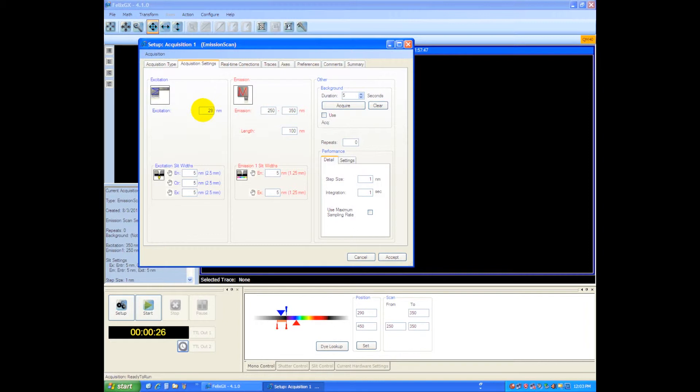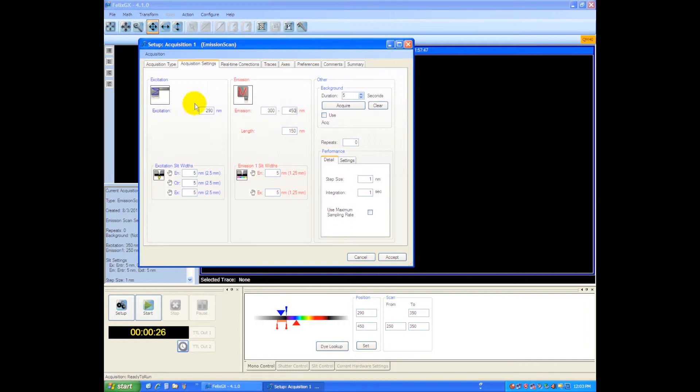This sample I'm looking at is BSA, which we're going to be exciting a tryptophan in this protein residue, and we're going to scan from 300 to 450 nanometers. So we'll be exciting at 290 and we're going to scan from 300 to 450 on the emission side.